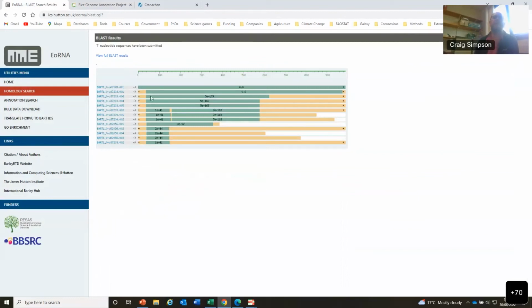So it's coming out with a really strong case. There's actually another one that looks very good as well. I would be looking at both those. So there's two genes here, 07178 and 37203. The other ones are alternative transcripts from that same gene. And then there's some sort of similarity. When you see something like this, it's usually some sort of domain that's conserved, like a DNA binding domain, so it's maybe not as related to the gene that you want or of interest. So again, I'll just go to the top one to look at it, and it will start opening up.